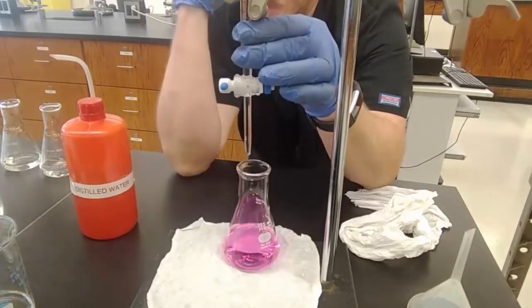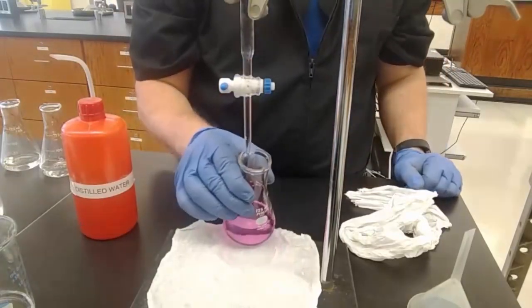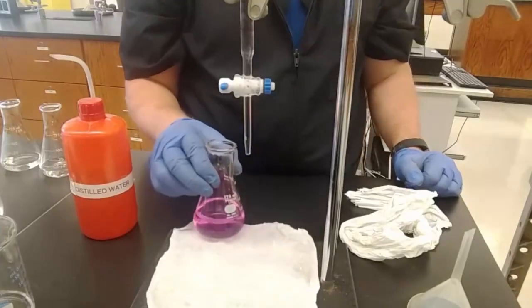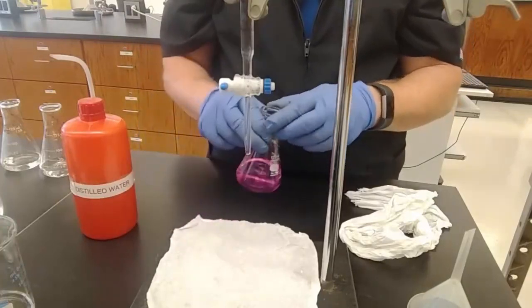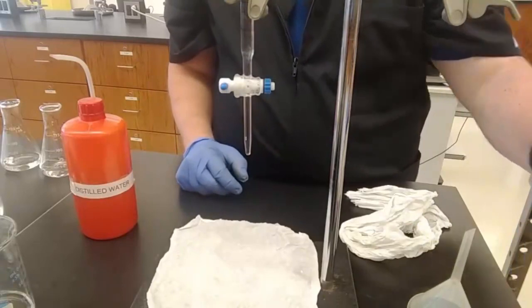17.39 milliliters. Knowing that is going to make it a lot easier the second time around. That took me 17 milliliters. All right, so we're good. Again, if I took a drinking straw and blew into the solution, it would turn back colorless because of carbon dioxide in the air. We'll see if it turns back colorless by the end of my other two titrations.